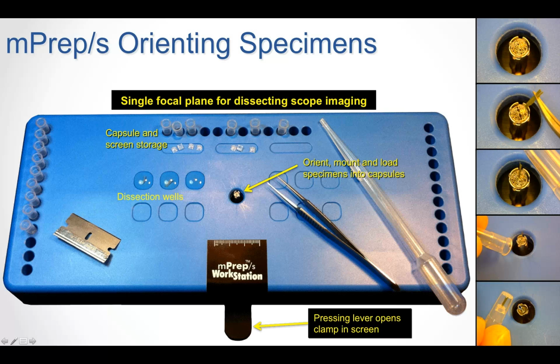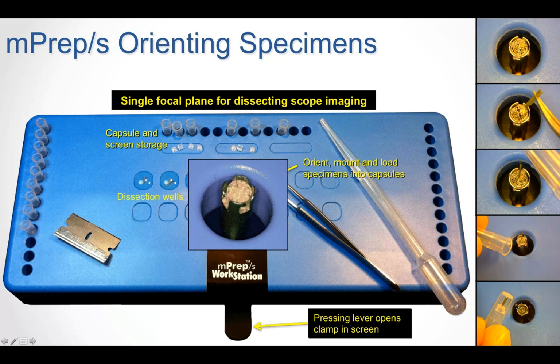But let's look at the thinnest possible sample that can be easily clamped. Here we have a human hair that mics to about 40 microns thin. So we can orient quite thin samples. Now, because this is a very, very skinny sample, if it were not pinch mounted, potentially it could fall through the 300 micron holes. But if it's pinch mounted, that's not going to happen. And we can utilize this feature to hold other kinds of samples as well.